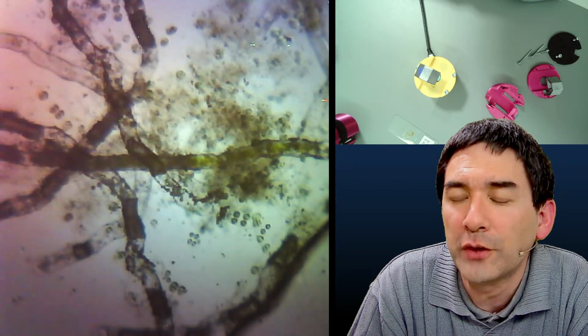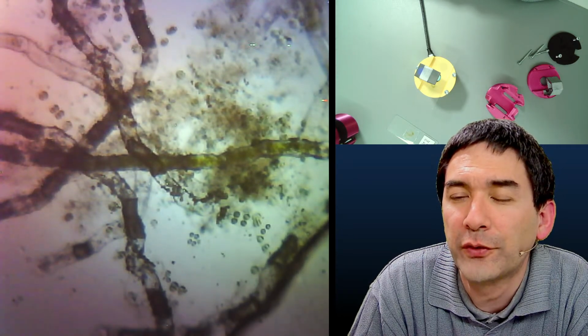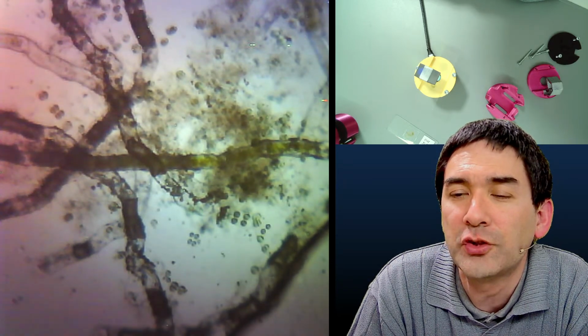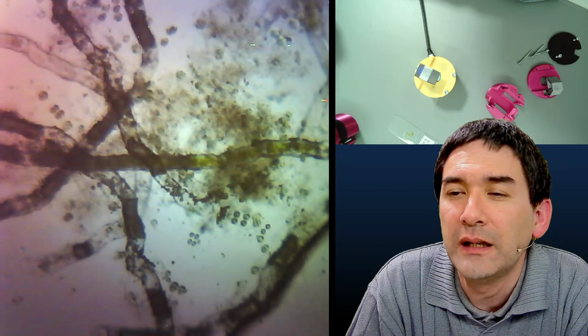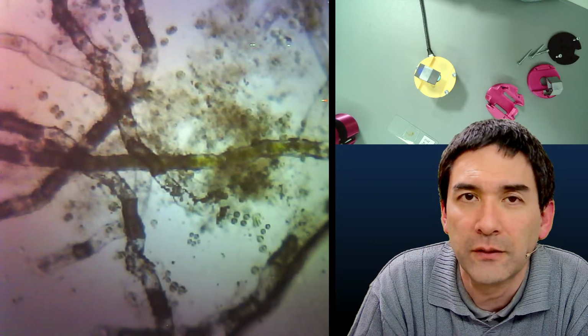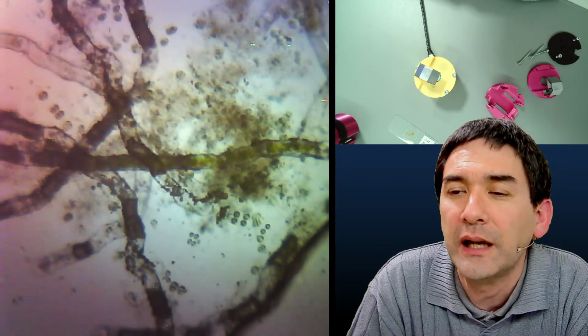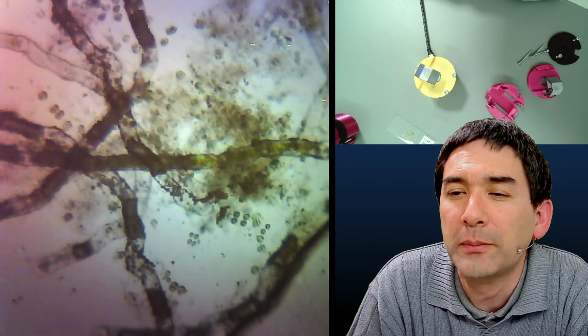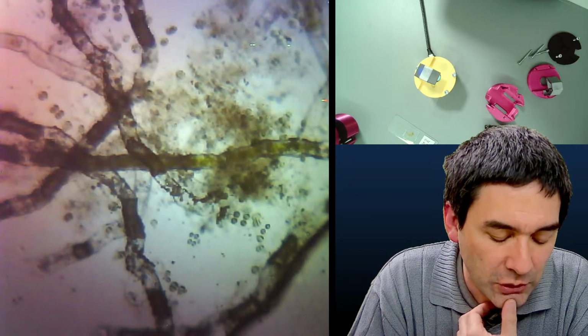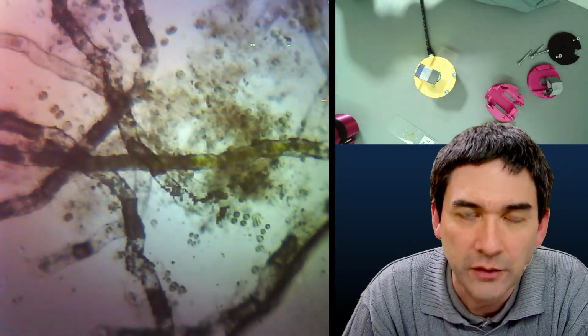A simple smartphone camera adapter works wonders for photographing through a regular microscope. It's a bit fiddly with the adjustment, but it's really effective. I have a $12 one, which I'm happy with. Yes, so smartphone adapters are definitely the first thing that I would try out. I think it's more directed towards people who don't have a microscope at all. I would say it's also directed towards people who want to do a little bit of tinkering around.